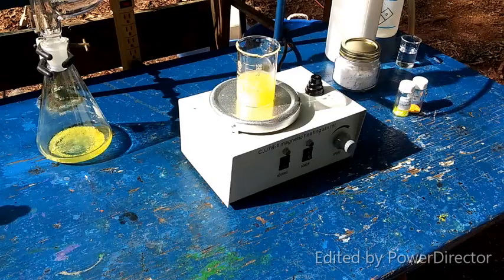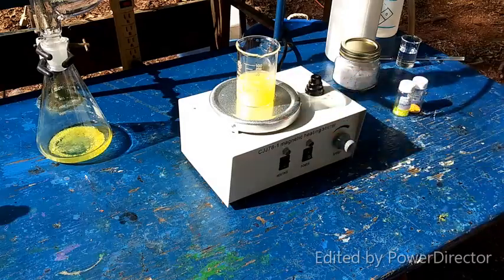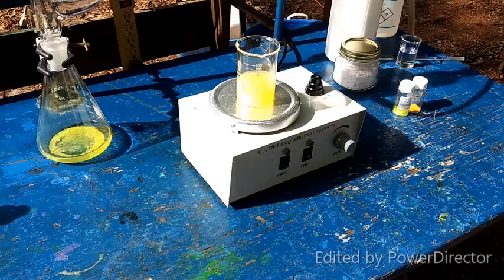It ends up, when everything is said and done, being kind of difficult to tell that you ever added alkali uranate to that at all. So, once you can't see any trace of it in there, I guess maybe you're good to go at that point. I don't know, guys. I've only done this just a few times. Like I said, I did some microscale experiments trying to work it out, and then I did one yesterday at this scale to make sure I had it right. Anyway, I'm going to let this stir for just a few minutes, and then I will come back when we're ready to start.